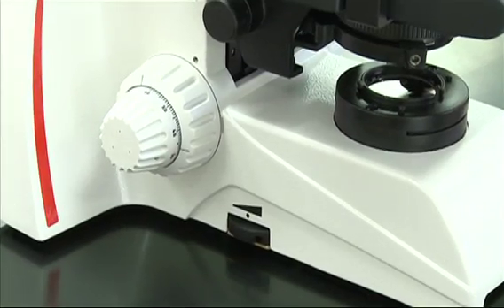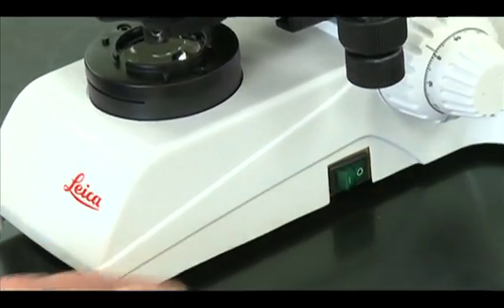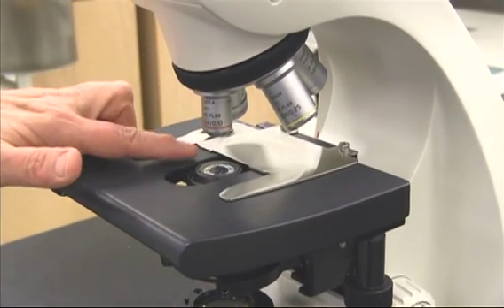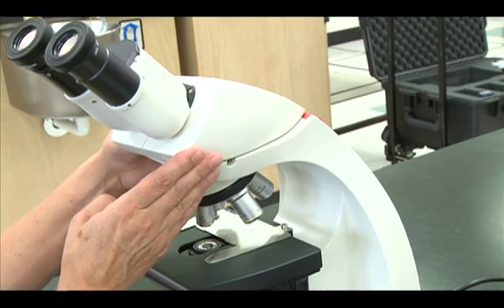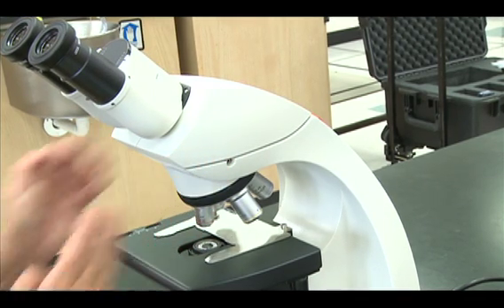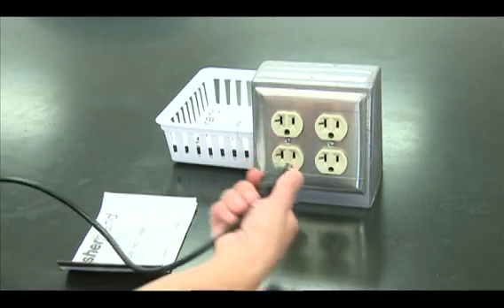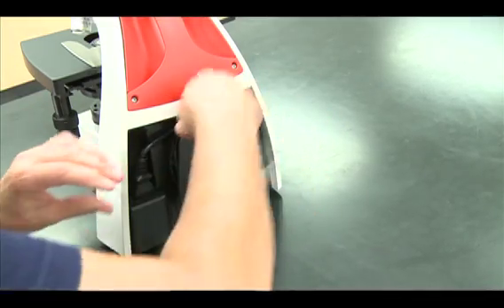Lower the rheostat to its lowest position and turn the power off. Make sure that the condenser is even with the mechanical stage. Make sure that the microscope head is aligned with the body of the scope. Unplug the microscope by the plug and wrap it into the cord holder. Never pull on the cord to disconnect.